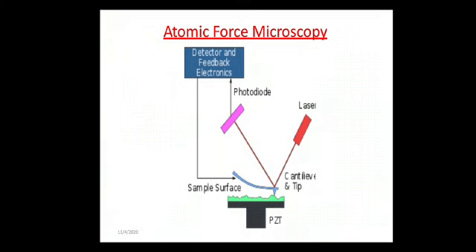The principle of operation of atomic force microscopy is that it uses a cantilever beam with a sharp tip to scan over a sample surface. As the tip approaches the surface, the close-range attractive forces between the surface and the tip cause the cantilever to deflect towards the surface. However, as the cantilever is brought even closer, such that the tip makes contact with the surface, increasingly repulsive forces take over and cause the cantilever to deflect away from the surface.